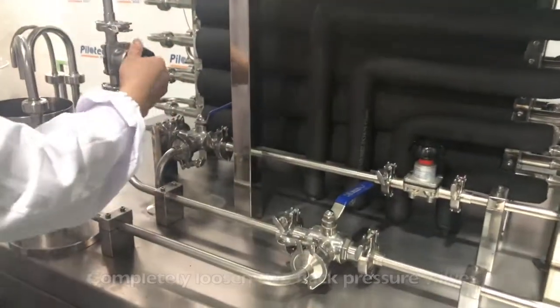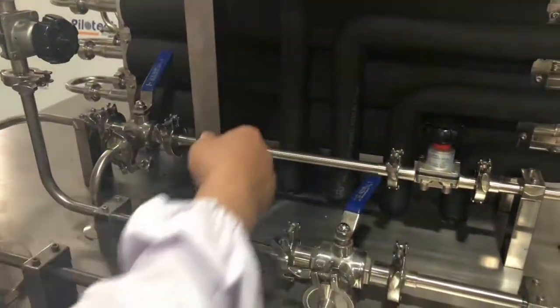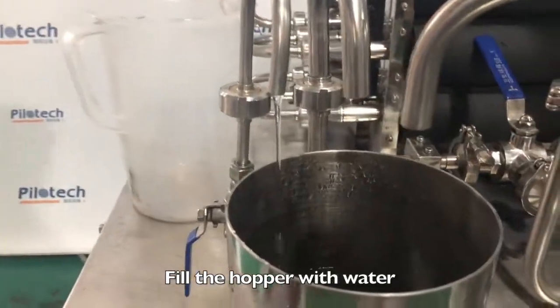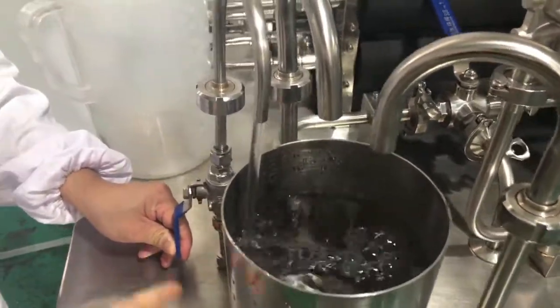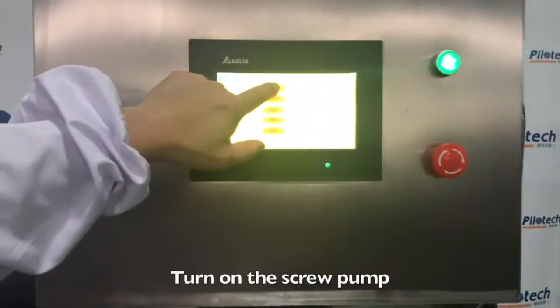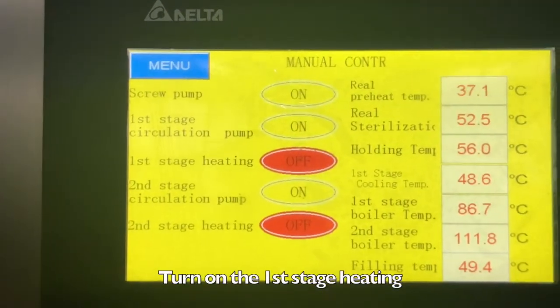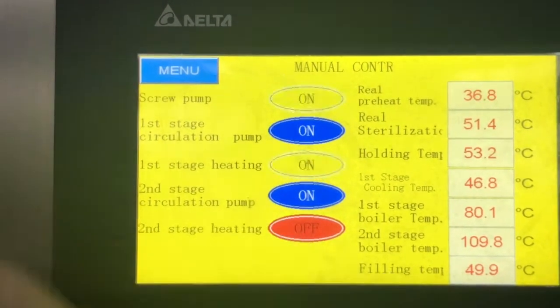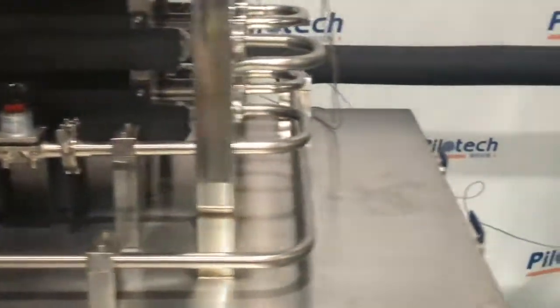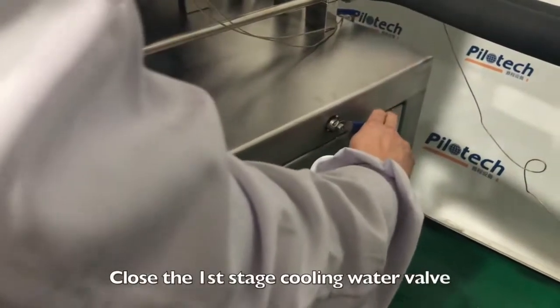Completely loosen the 2 back pressure valves. Turn the two three-way valves to the return position. Fill the hopper with water and close the feeding valve. Turn on the screw pump, the 1st stage circulation pump, and the 2nd stage circulation pump. Turn on the 1st stage heating and the 2nd stage heating. Close the SIP cooling section water filling valve and close the first stage cooling water valve.